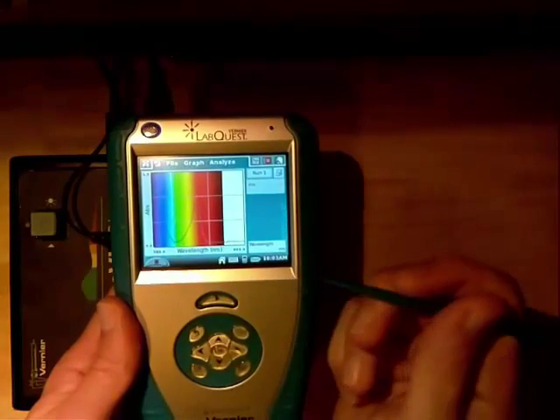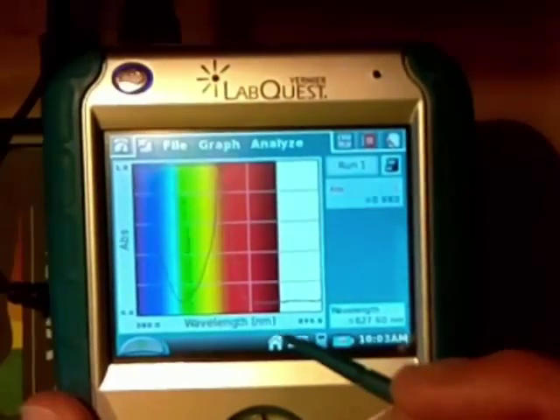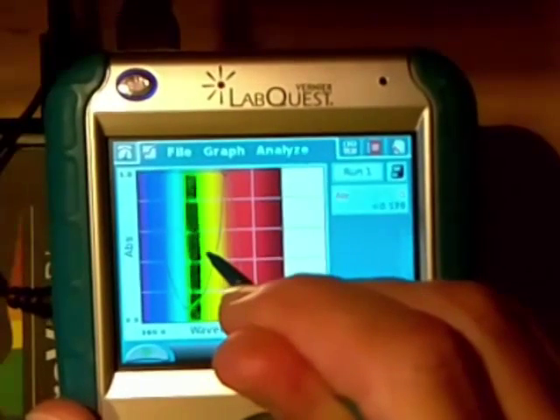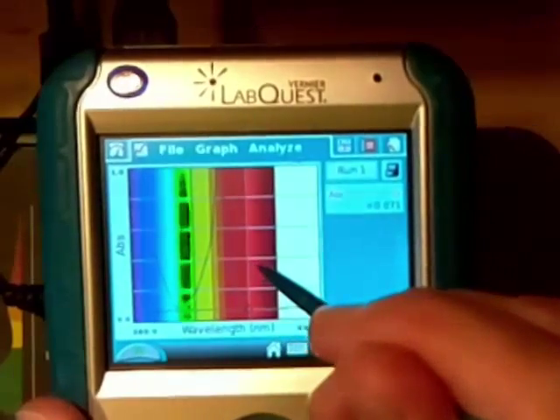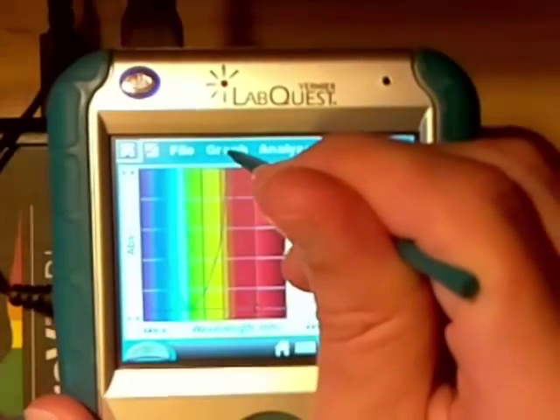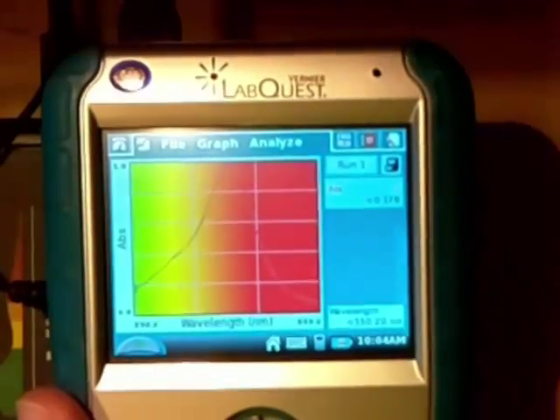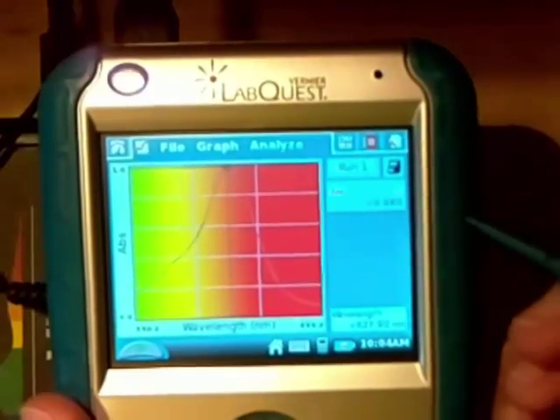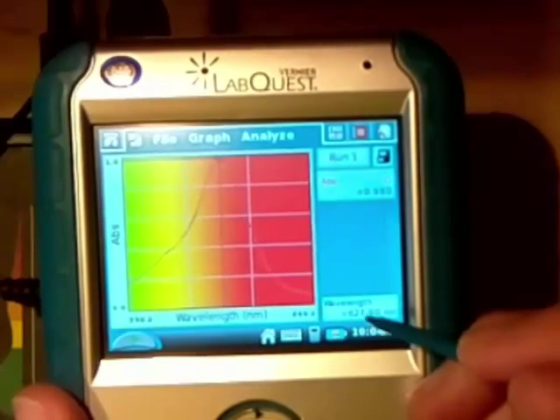Now it stops and auto-scales. One of the things I can do in post-processing is click and drag to highlight part of the area — it's a little darker on the actual screen than it appears in the video. Then I can go up to Graph and zoom in, and that zooms right into that peak. I can single-click and a cursor appears in the lower right-hand corner telling me that this wavelength is 627.9 nm.